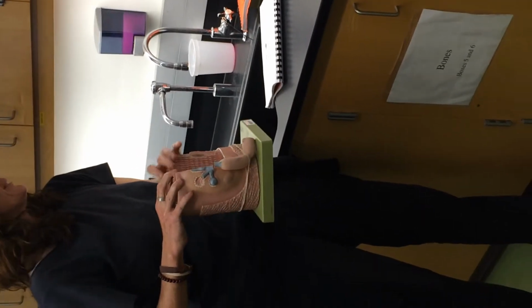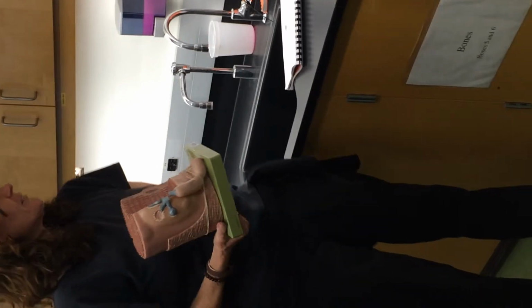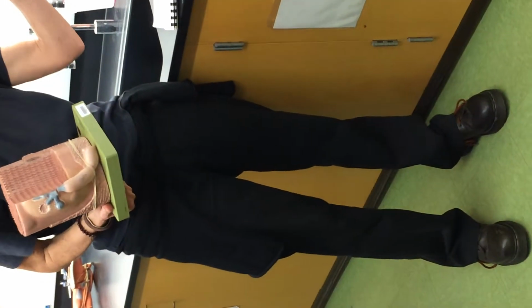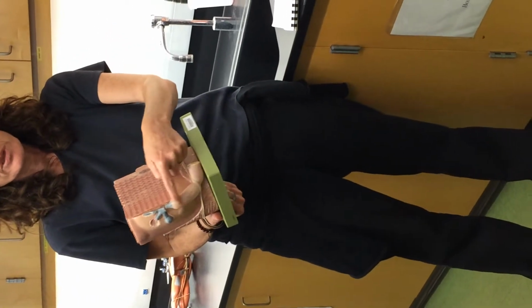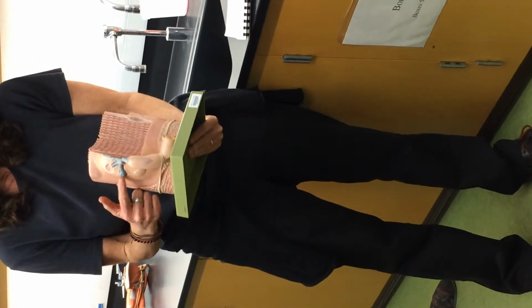So given that, here I qualify it all. Page 62, it says somatic motor neuron. The actual neuron is not visible on these slides or in the model, so we know that. But this is the axon of it, or the telodendria. Would you agree? This is a branch. That's the myelin sheath, right? And the axon in the middle has all those things there. So you go check telodendria, check, and that's the synaptic end bulb.